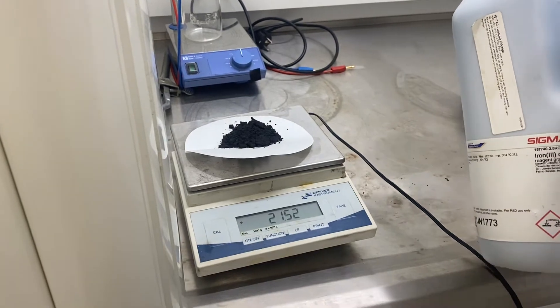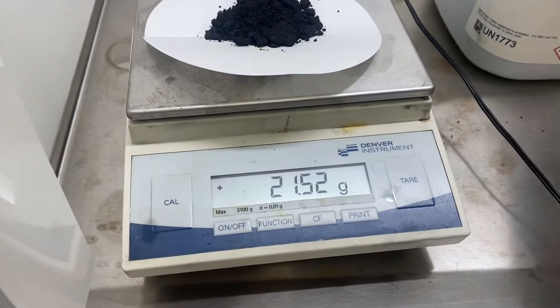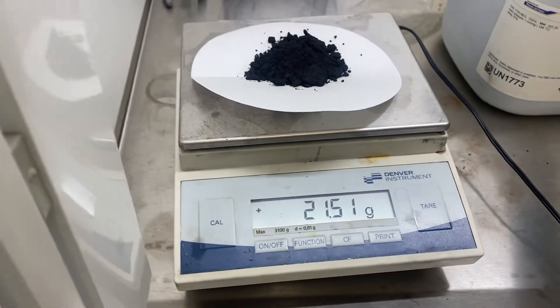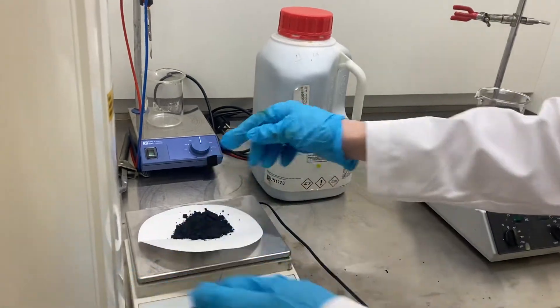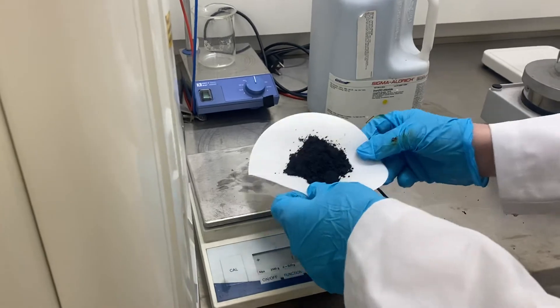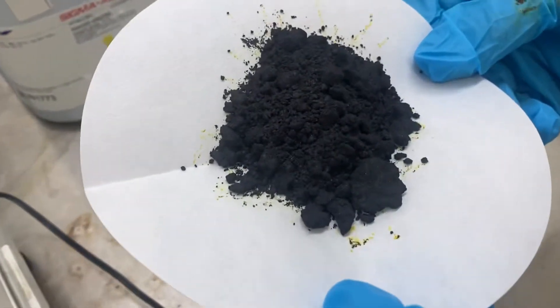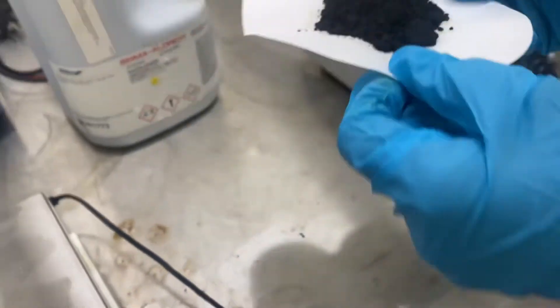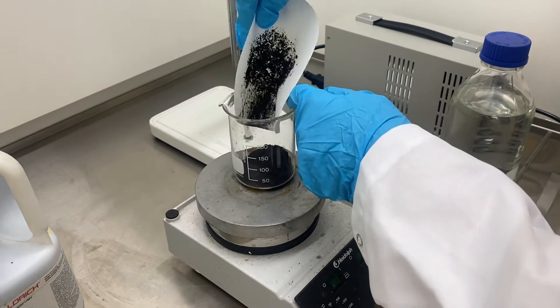That's 21.52 grams. So that's the ferric chloride weighed out. This reacts quite strongly with water. So 21.51 grams of ferric chloride — you can have a closer look. That's the ferric chloride powder going into the beaker like this — put as much in as we can.